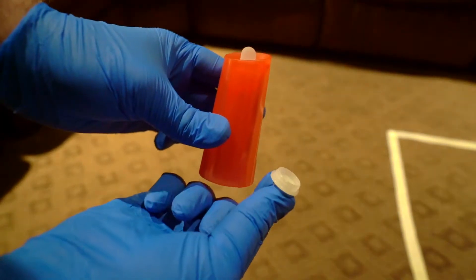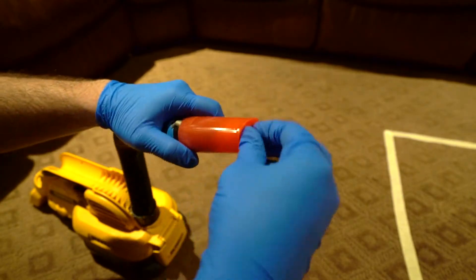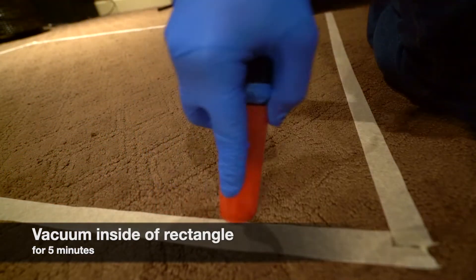You will then remove the bottom white cap from the dust collector and attach it to your vacuum's hose. Then, remove the top white cap and begin vacuuming the entirety of the rectangle for five minutes.